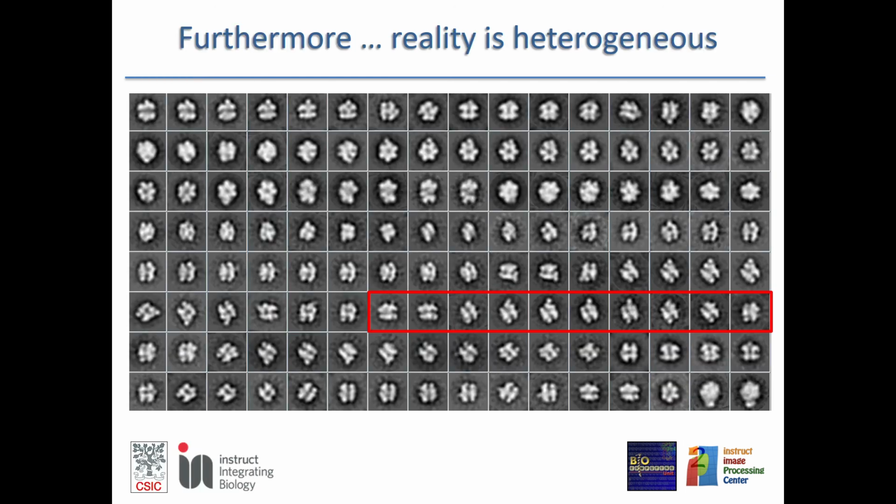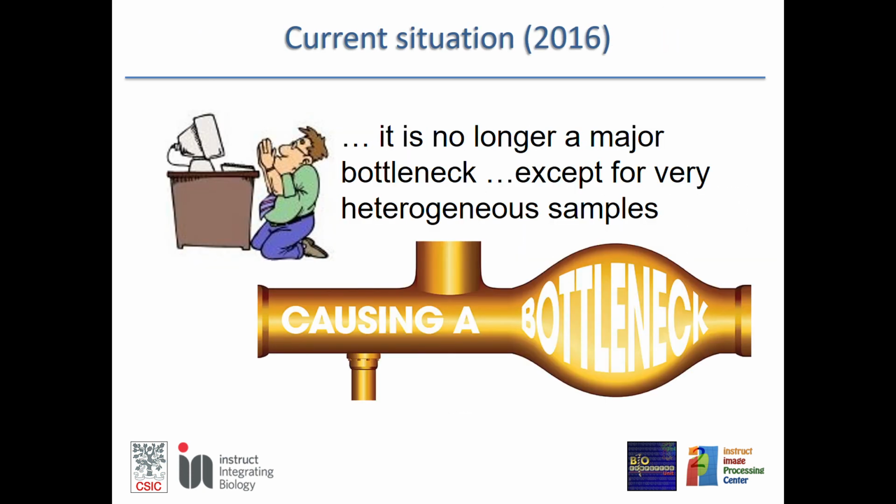So at present, you should be aware that if you use a wrong initial volume, then you might be in trouble, but there are enough tools to overcome this situation.